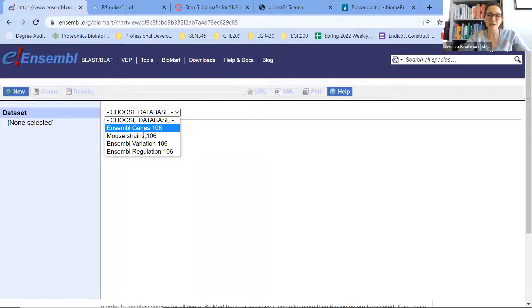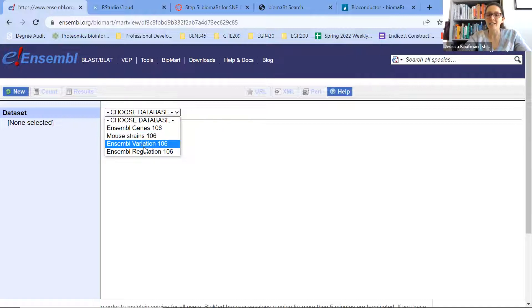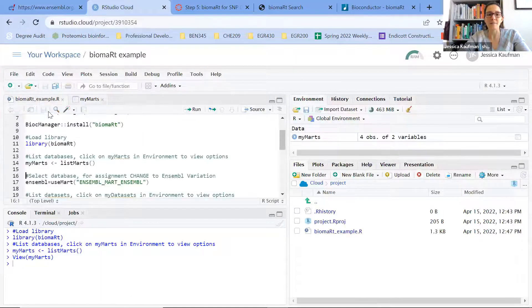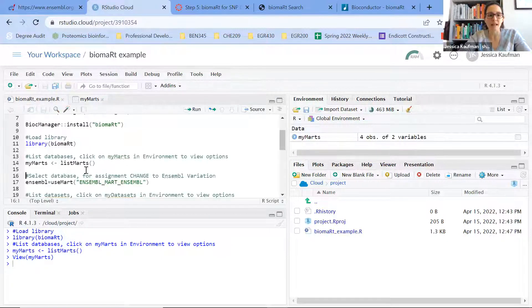I'm not interested in looking at data for genes — I'm interested in looking at data for SNPs. I need to change to Ensembl Variation. I can do that in my code by copying the name of the variation database, Ensembl Mart SNP, and placing it in the mart argument.